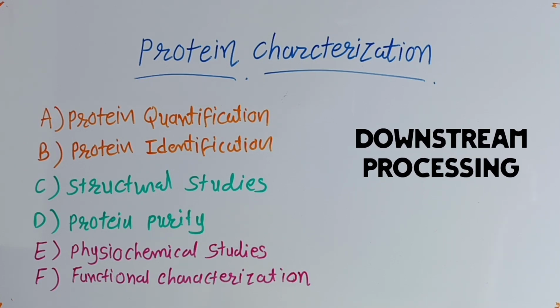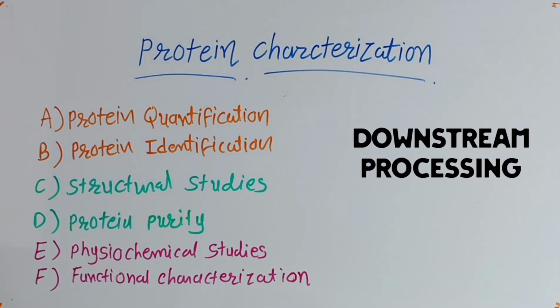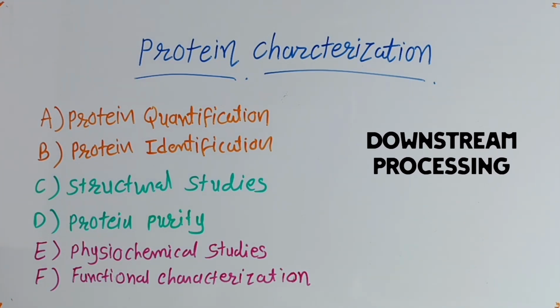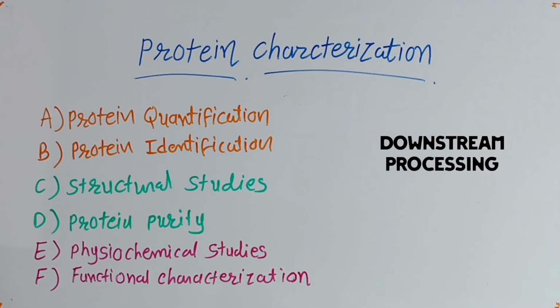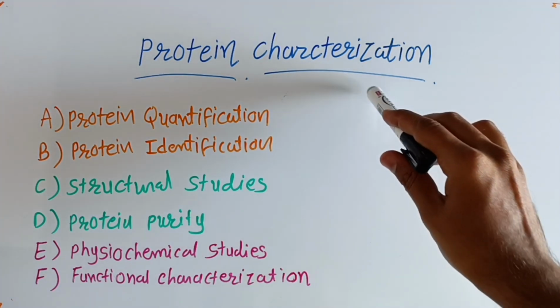When we talk about protein, the various experimental methods that allow for the detection and isolation of the protein are defined as protein characterization.